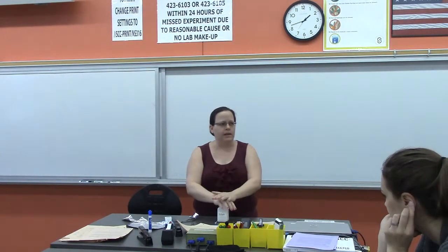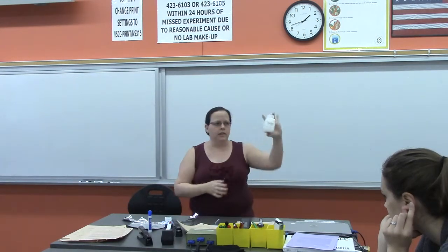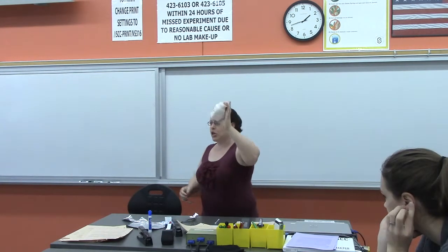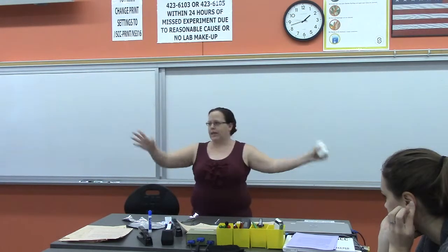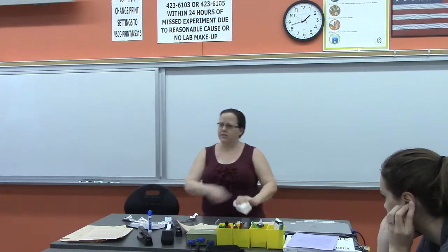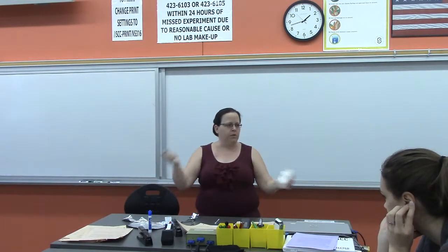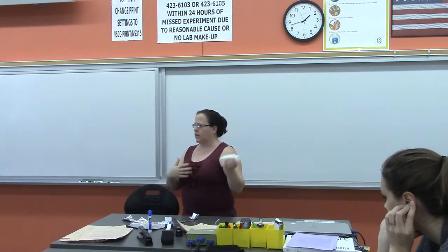The reason we do that is you're using several solids today that look just like sugar. If we start having caps and things all over the counter and the spoons go all over the place, people are going to be like, oh yeah, that's fine. And then all of a sudden they put the salt spoon in the sugar or the salt lid on the wrong thing, and now everything's cross-contaminated and we've got to clean up and start over.